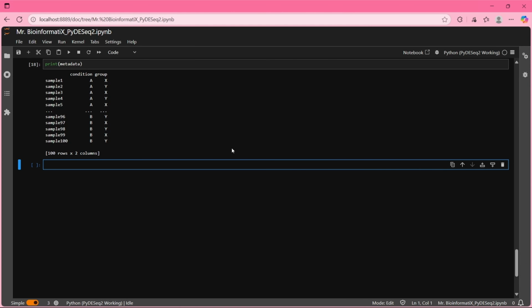So to perform multifactorial analysis with PyDESeq2, we start by initializing a DeseqDataSet as previously, but we provide several variables we would like to use in the design argument.